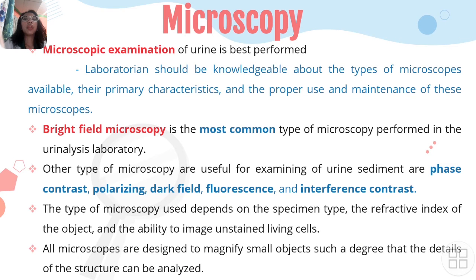Microscopic examination of urine is best performed by laboratorians who are knowledgeable about the types of microscopes available, their primary characteristics, and the proper use and maintenance of these microscopes. Bright field microscopy is the most common type of microscopy performed in the urinalysis laboratory.